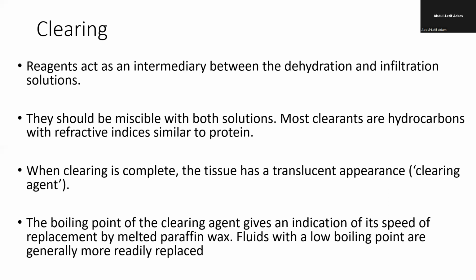So I told you that from the beginning, when I was giving a gist, an overview about the clearing. I mentioned to you, clearing also removes certain proteins and other chemicals that make the tissue dense, so that you will not be able to see it well. So when you use the clearing, it also makes the tissue a bit transparent or a bit translucent, so that it can be seen through. Okay, it can be seen through.